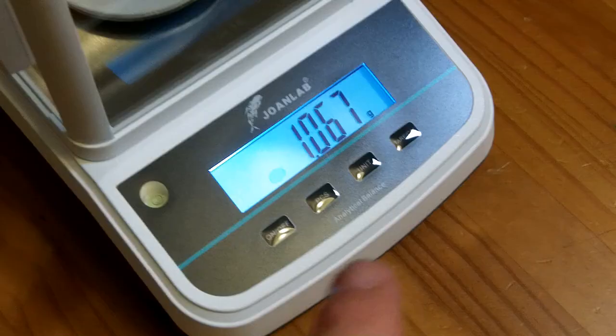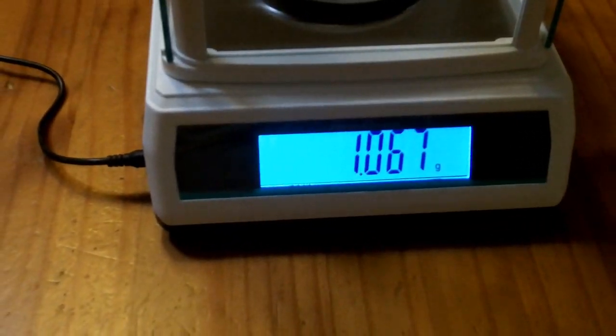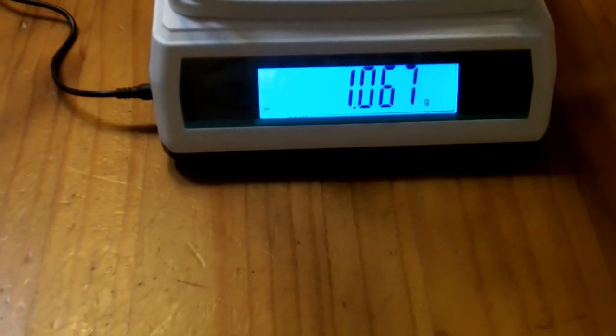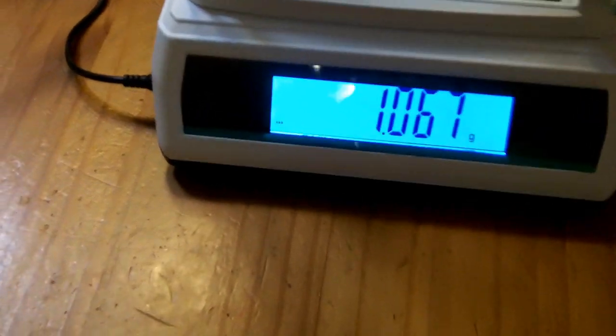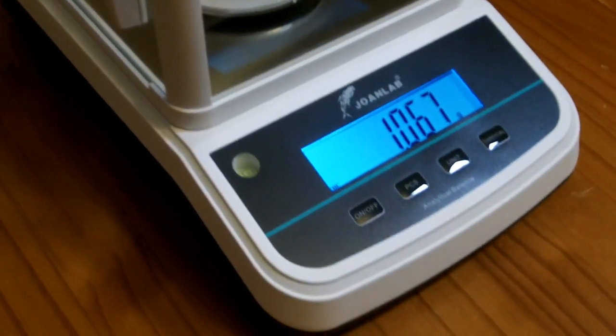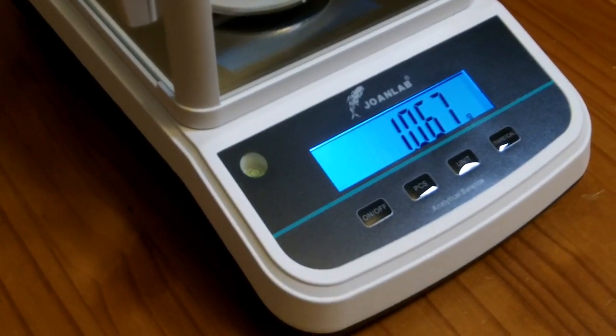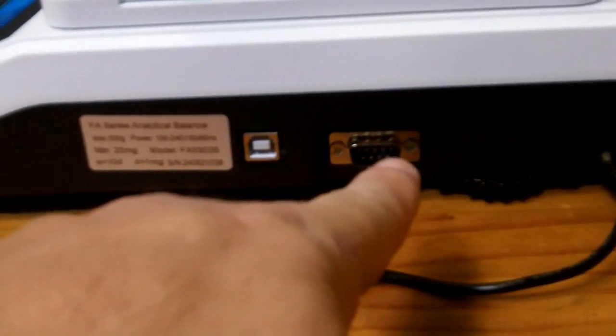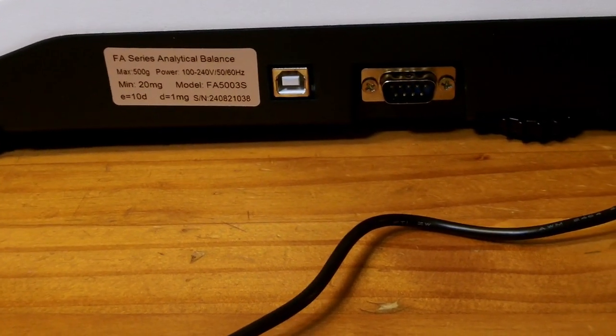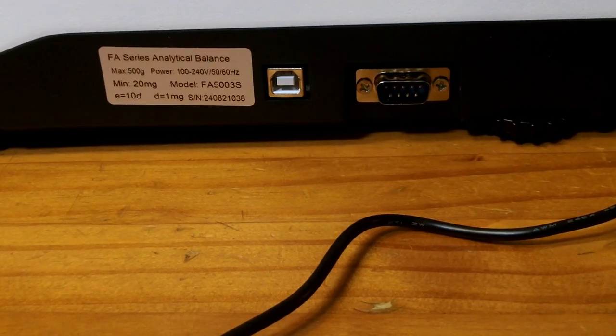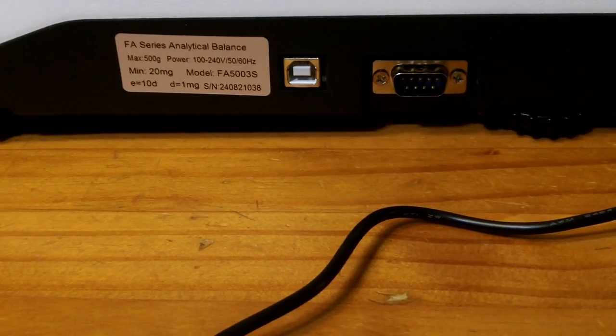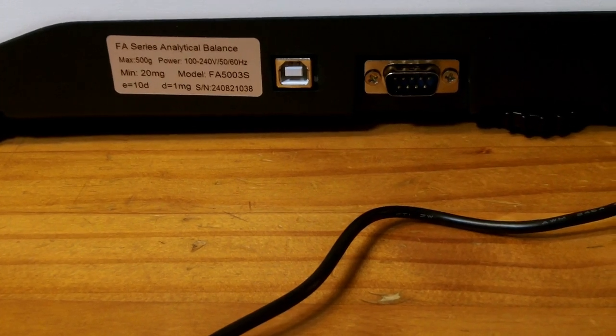But you can adjust these to make sure that bubble level is perfectly centered. So the controls are only on the front, but I do appreciate the fact that there's a duplicate readout on the back. So that's good if you're in a chemistry lab where it's a college or a high school teaching environment, where multiple people have to see this at once, or if you're working from different sides of a table. Now I have not tested the output on the USB and the RS-232 ports. There is a calibration procedure to change the baud rate on the RS-232 port. But my understanding is it just outputs the current weight.